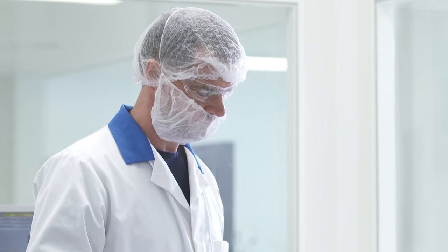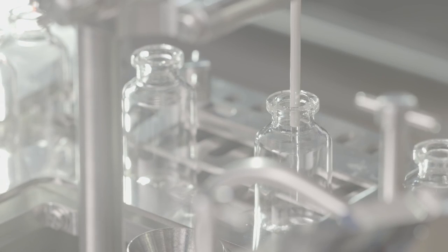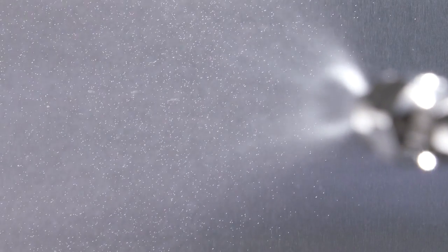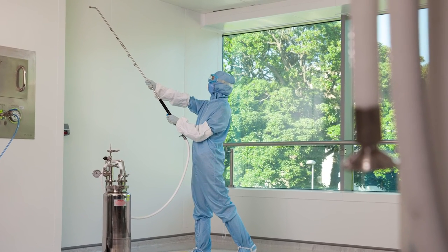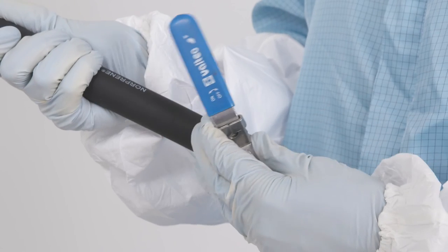The Clear Side Pressurized Spray System gives clean room managers the ability to cut process time significantly while ensuring thorough surface coverage with disinfectant solutions. Ecolab's Clear Side Pressurized Spray System is the modern answer to clean room hygiene management.